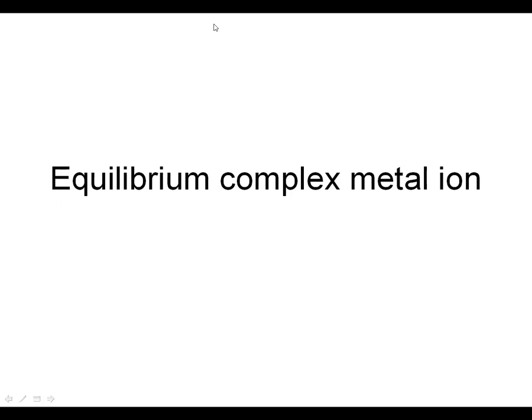Okay, so let's actually talk about the experiment and sort of what's going on. There's really two parts to this experiment. The first part is the Le Chatelier's principle part. So the first part is really the Le Chatelier's. Badly spelled there.